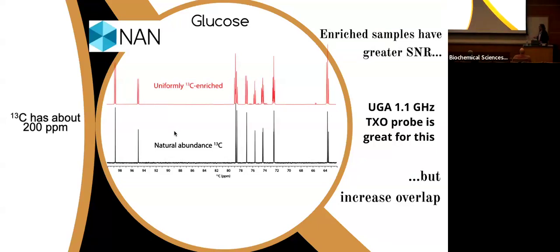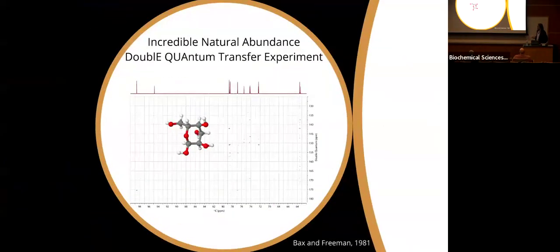So now I'll show you what we can do with some of this. This is an INADEQUATE spectrum. Anybody other than Milo and Katie and Chad and Sam probably have never heard of an INADEQUATE spectrum.